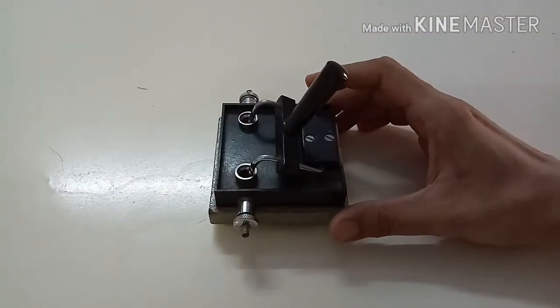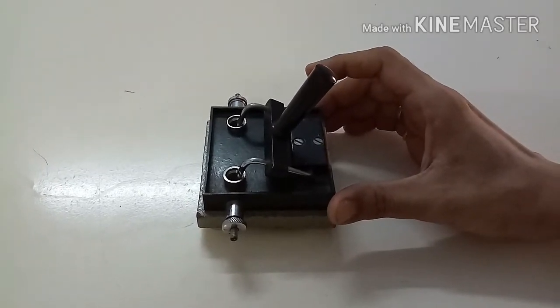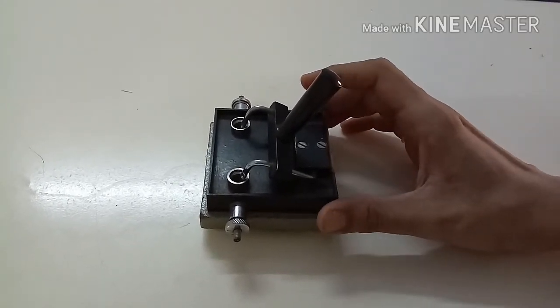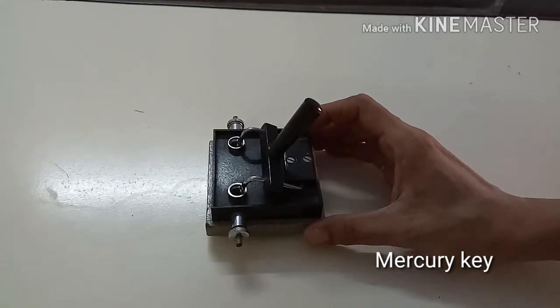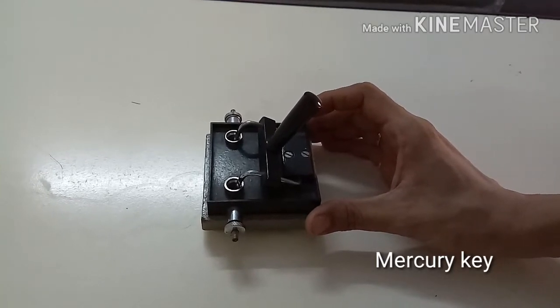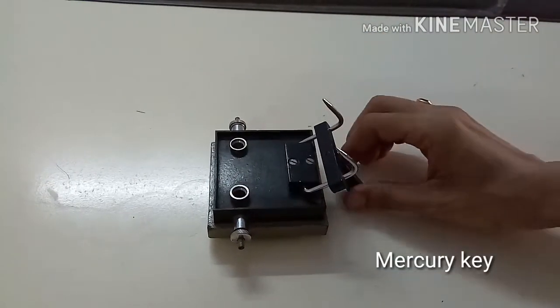Next is Key. Any device which is used for interrupting or completing a circuit is known as a key or a switch. Two types of keys are used in experimental work: a simple key as well as a short circuiting key. The simple key is also known as a mercury key or primary key, and is used for making or breaking circuits. The short circuiting key can be used for making or breaking the circuit as well as for diverting the current through a path of very low resistance to cause a short circuit. This key has two terminals which are embedded in mercury cups, which provide low resistance contact.